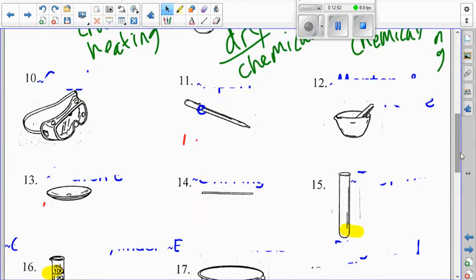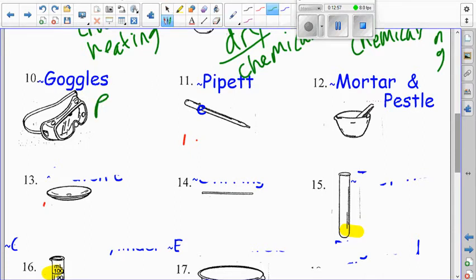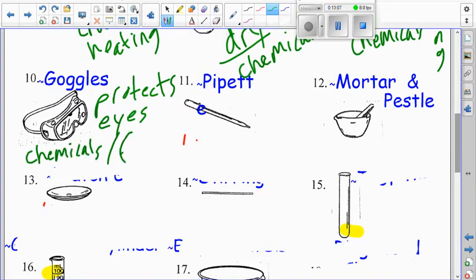You got goggles here. Goggles protect eyes. Protects eyes from chemicals or fumes. So sometimes they can protect you from fumes. There's three flavors of glasses. You can use normal ones right here.